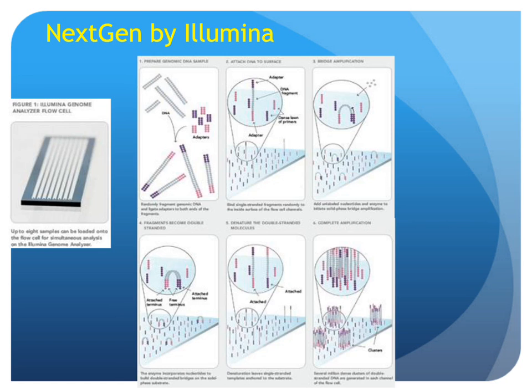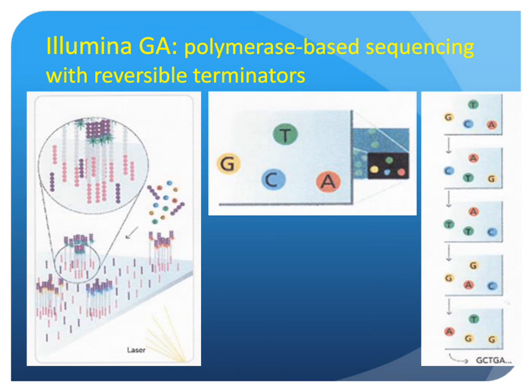This is then placed into the sequencing machine, and the sequencing platform does sequencing by synthesis. Some of the key features of this are that the 4 nucleotides are each blocked. They have a different fluorescent color, and when they are added to this, they bind to the individual cluster where the base that they're complementary to exists. And then subsequent to that, a photograph is taken, and you can see what color has actually been incorporated.